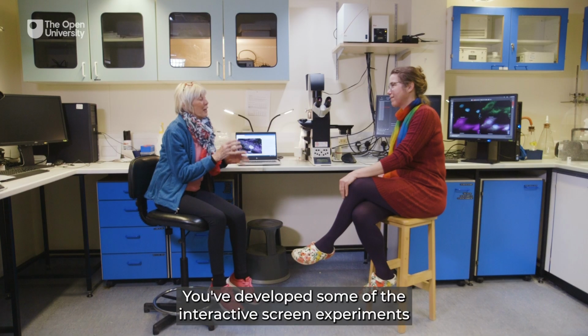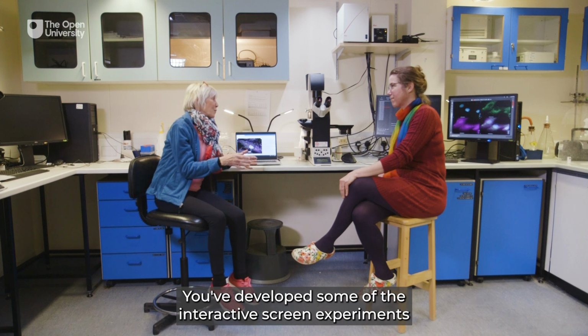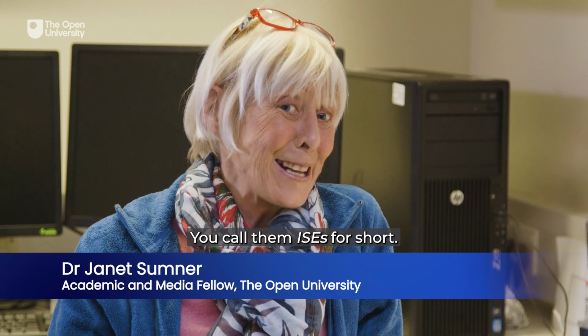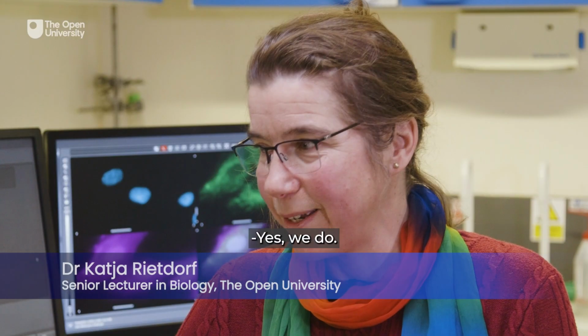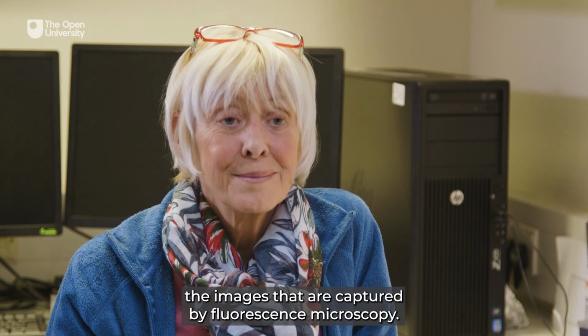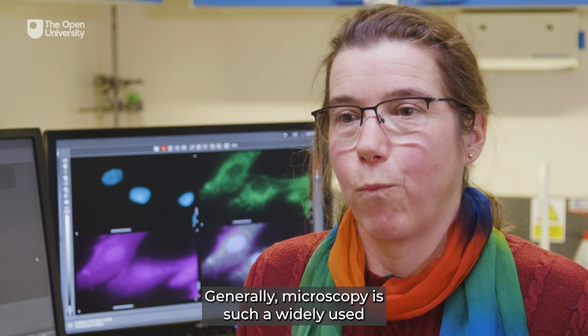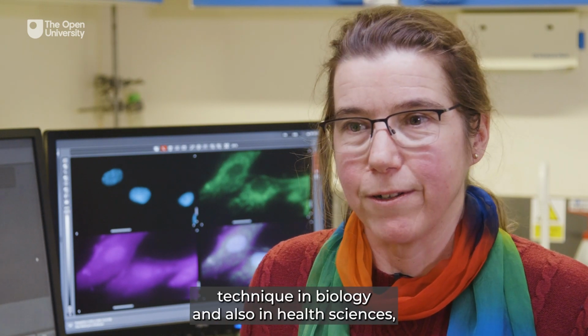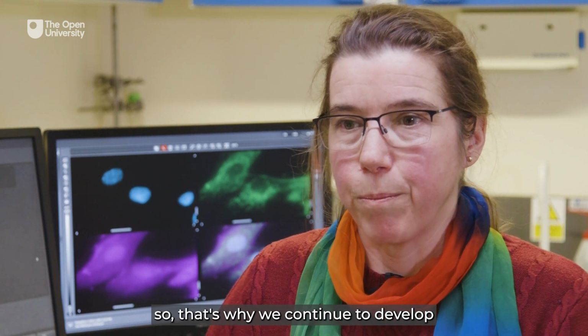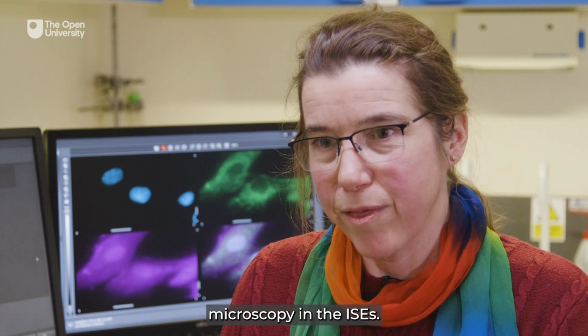Katja, you've developed some of the interactive screen experiments that the students might use. You call them ISEs for short. Yes, we do. The ones I developed are a digital fluorescent microscope and another ISE that is used together with it to analyze the images captured by fluorescence microscopy. Microscopy is such a widely used technique in biology and also in health sciences. So that's why we continue to develop microscopy in the ISEs.